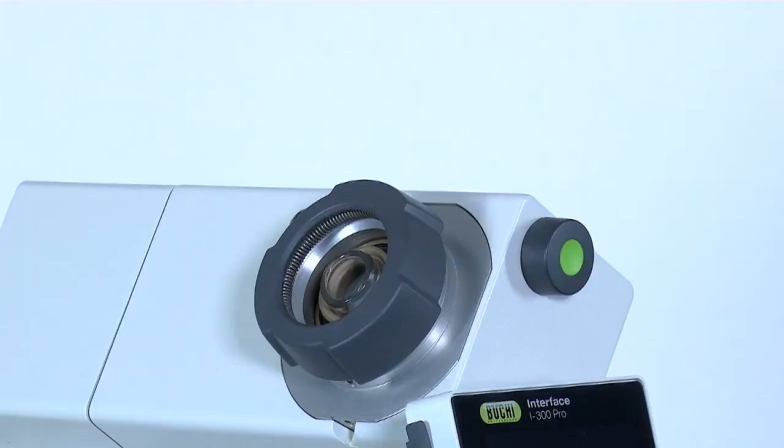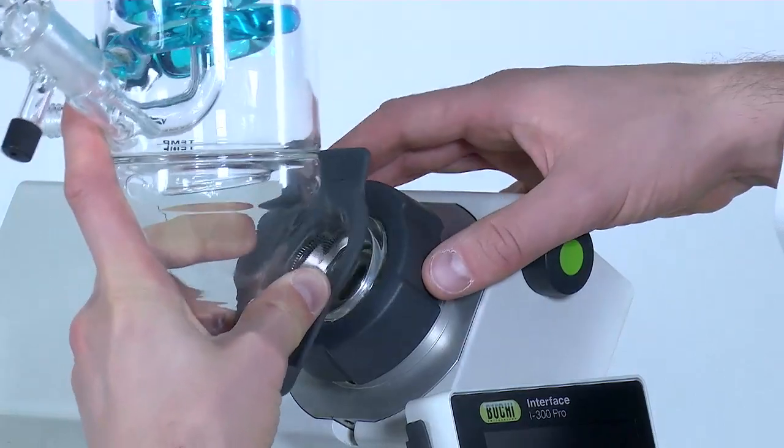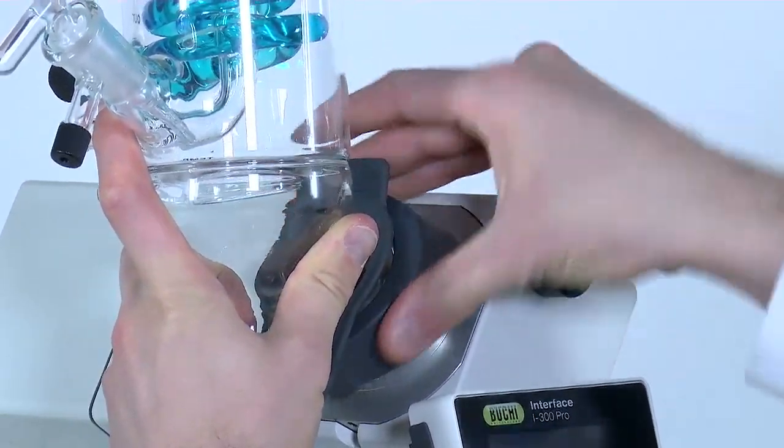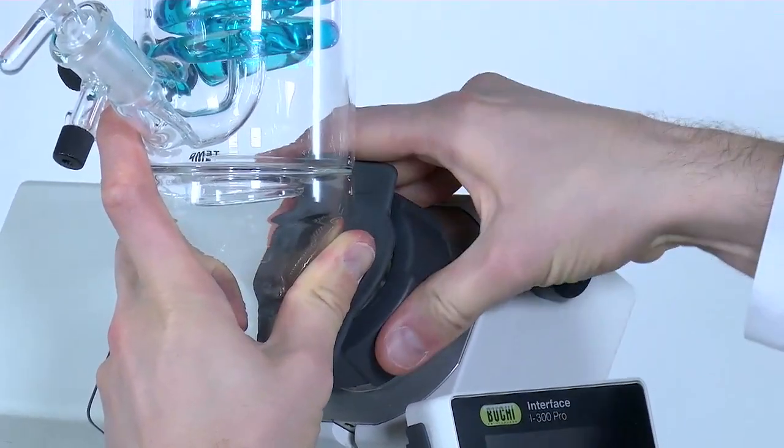The last step is to place the condenser on top and screw in the flange. It is mandatory that you always follow this sequence.